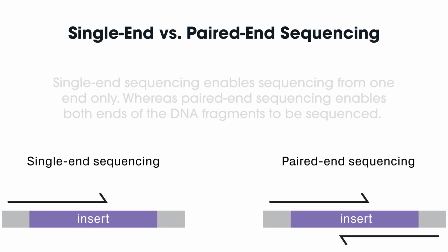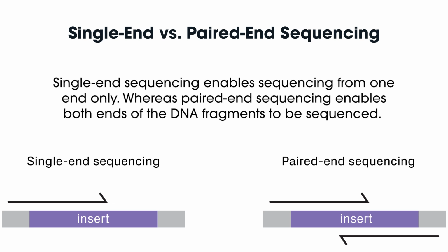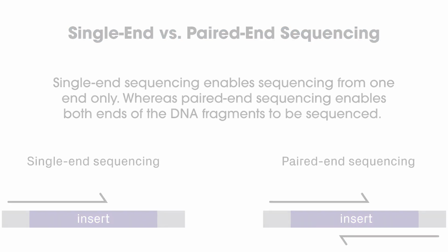Short-read sequencing can either be done unidirectionally, or single-ended, or bidirectionally, paired-end sequencing, and aligned to a reference genome or transcriptome, or assembled into a de novo transcript. Paired-end sequencing is usually recommended for most applications. This is because it provides richer data and a longer insert length, permitting a longer library. It's also the most common sequencing type and is often the most cost-effective.